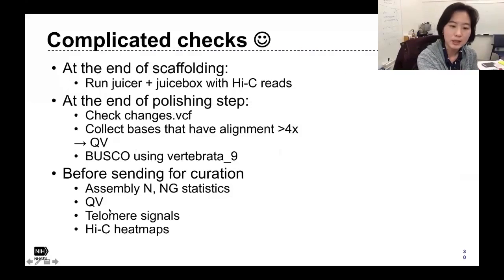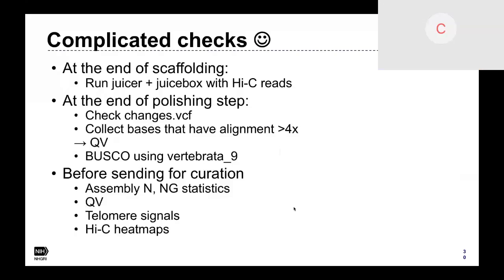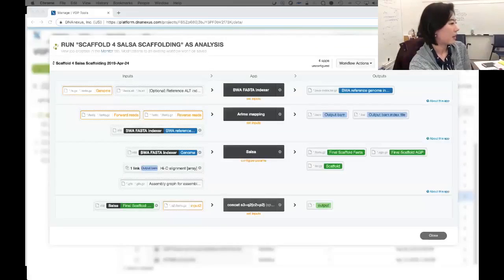So I'm rerunning the one more QV step, the Long Ranger Freebayes step, locally. My pipeline prints at the end the QV of the assembly that was given, like the input assembly QV. So I can check what the QV is from the Illumina data. And also, if you already have the script that can calculate the QV here, I think I can make the app for that. So it should be very helpful for us to check this upfront, without the concern that we wait until we get all the assembly results and check this, wasting money. Yeah, I think that's a good idea.